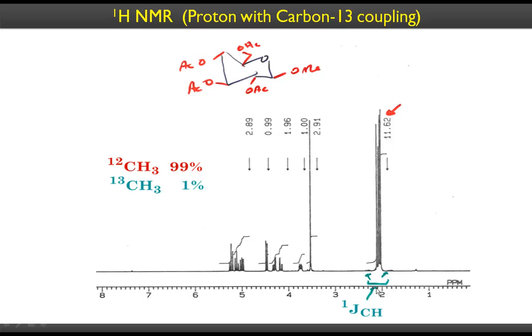As you can see, this is a molecule where you have 99% of carbon-12, only 1% of carbon-13, that's a natural abundance. So there's only one hydrogen that is attached to this carbon compared to the 99 hydrogens. The 99 hydrogens produce these peaks, that one hydrogen that is in turn attached to this carbon would produce the peaks that would have spin splitting, but those splittings would be gone into the baseline, the noise, so you don't see them. Okay, so just to kind of clarify if you have the doubts.